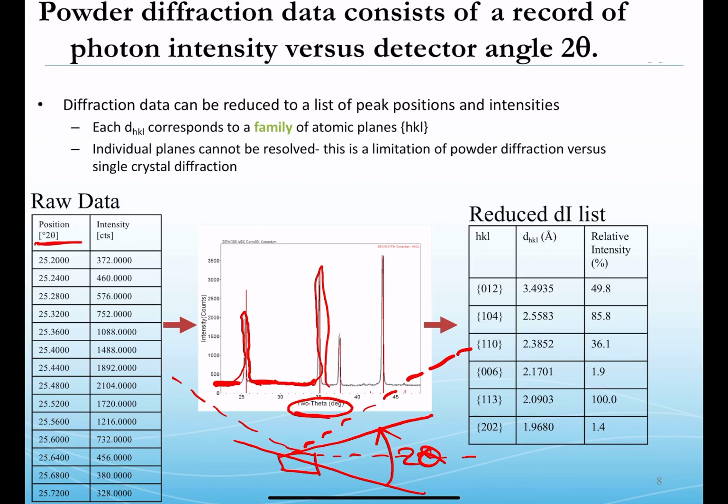So here we have the position 2 theta generated by the mechanics of moving the X-ray source and the detector sweeping towards each other through lots of options for 2 theta, and then monitoring the amount of intensity for the X-rays at that detector. Okay. And then through either tabulated information and what's known for certain materials, we could identify planes detected, so identify the d values from Bragg's law, ultimately by solving Bragg's law for d, and then deducing what planes must be responsible, and we'll see that in a moment.